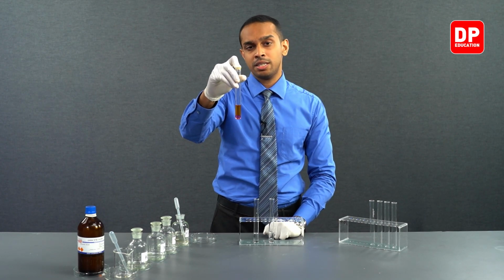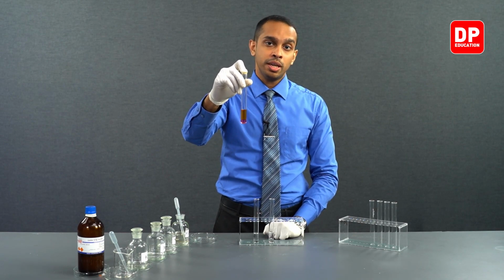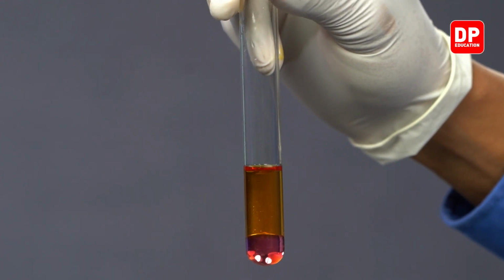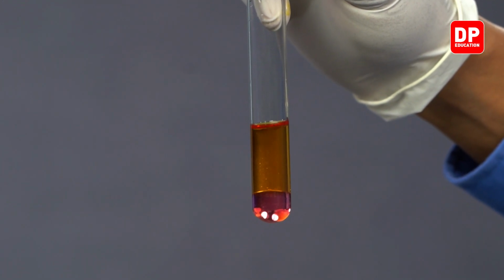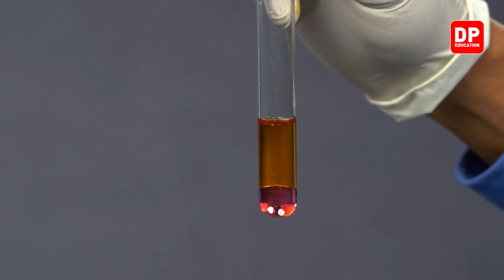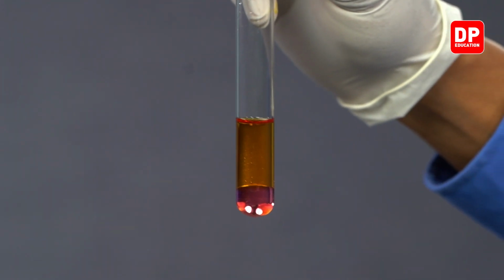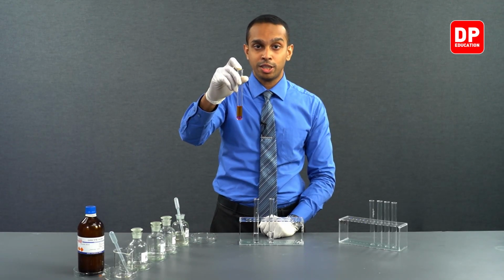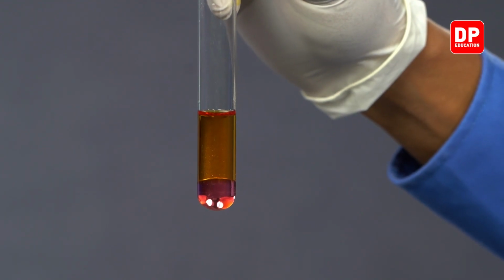This test is evidence that if you add chlorine water into an iodide ion solution, the iodide ions will convert into iodine and be displaced. And then if you add an organic layer like this, that iodine will dissolve in the organic layer due to its nonpolar nature, and you can observe the purple color like this.